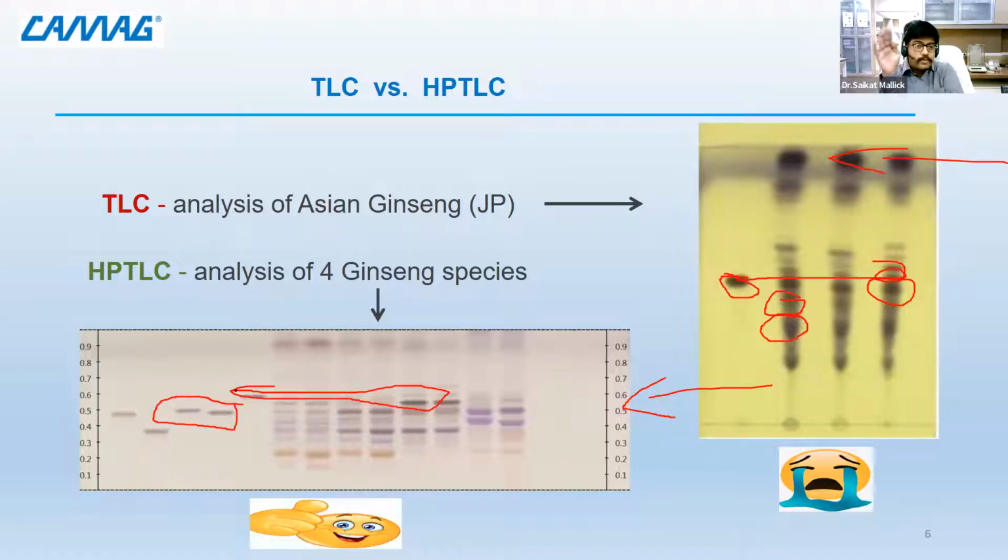Now, as we have the final process in our mind that we have to do a bioautography study, the important part is to get a good separation, and the importance starts here. If you don't get a good separation, imagine this plate, if I dip it on the right hand side, with which I have done a TLC, in a bacterial solution or any other chemical assay for the analysis which I want to do. If I do such an assay, since the compounds are in very high quantity, first of all, they may solubilize in the reagent, and that is why it will not show you compact bands. And thirdly, you may get a big spot over here. You are uncertain whether it is due to this spot or this spot, and the whole experiment is a big failure.